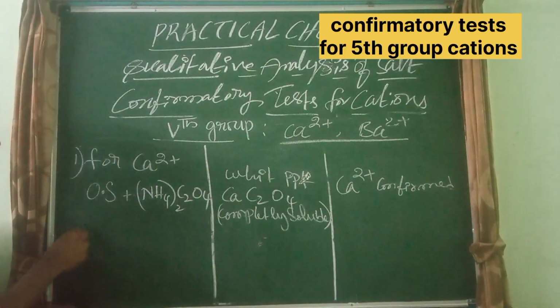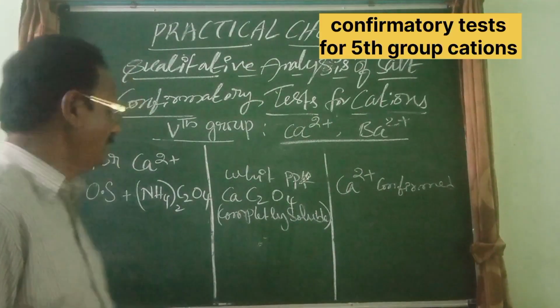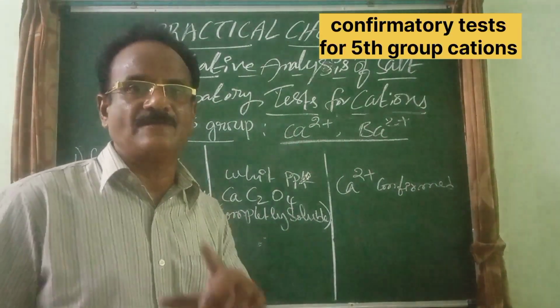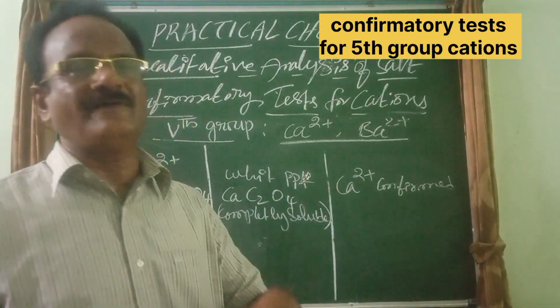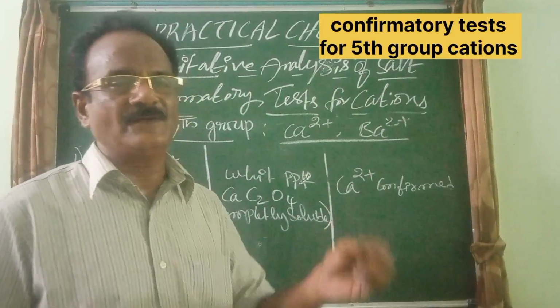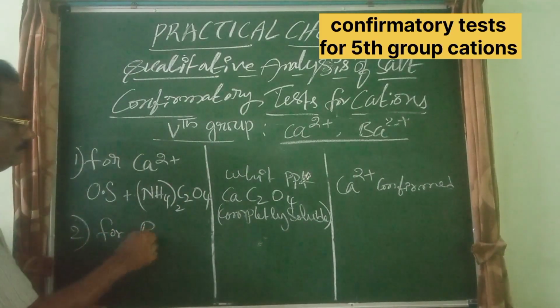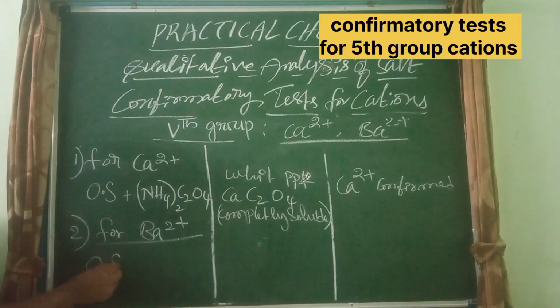Let us see. For Ba2+ also the same test can be done, using ammonium oxalate. But to avoid confusion, I will write another confirmation test for Ba2+. See here. This is also a very simple test.